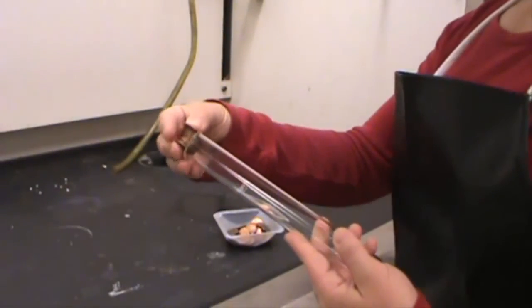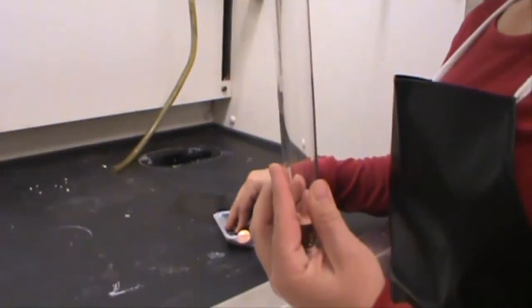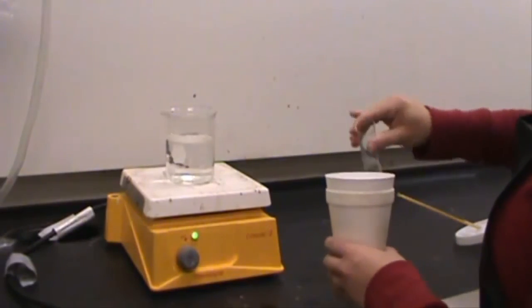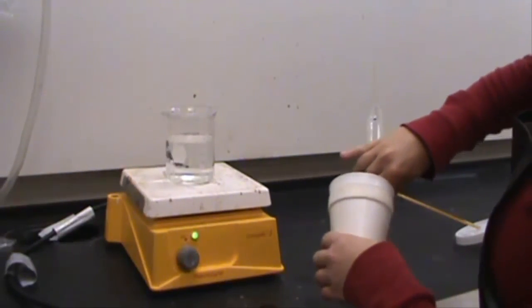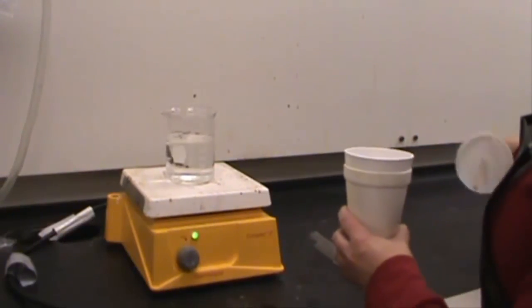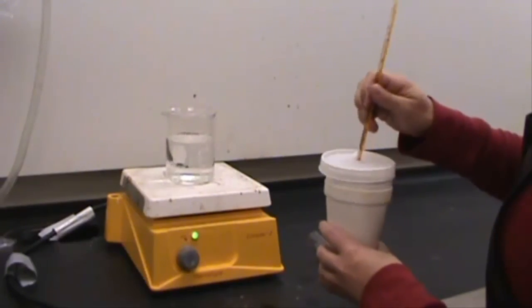When putting the copper pennies inside the test tube, gently place them inside and slide the pennies down. When transferring the copper, make sure to hold the very top of the test tube where it is cool, and then quickly and carefully slide the coins into the calorimeter and place the lid on top and begin stirring. If you need help with any of the write-up, please speak with your instructor.